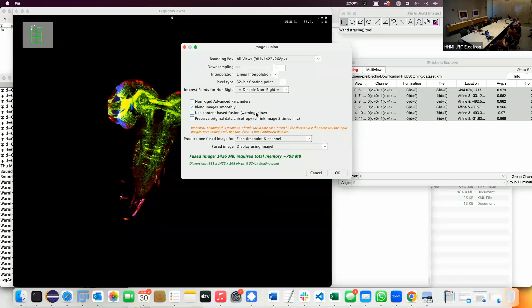We have a content-based fusion which is mostly important for multi-view data where you have two overlapping images and one is significantly sharper. You estimate the local contrast or local resolution and prioritize the non-blurry image over the blurry one. In this case it makes no sense, but it makes sense for multi-view images. The last option is Preserve the original data anisotropy — you usually want this when you just tiled, because you oversample XY compared to Z. By default Big Data Viewer makes everything isotropic, but you don't want to save it that way — it's just a waste.